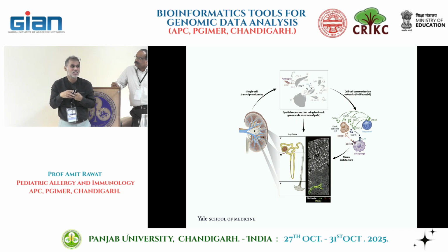So in spatial transcriptomics, there are different methods and different platforms to do it, but you can do it. Single cell spatial transcriptomics can also be captured at a single cell resolution.